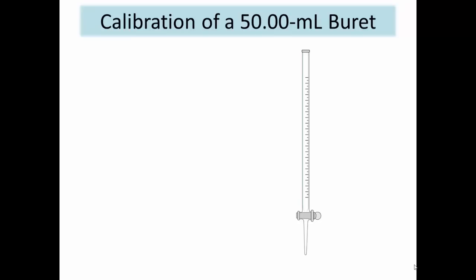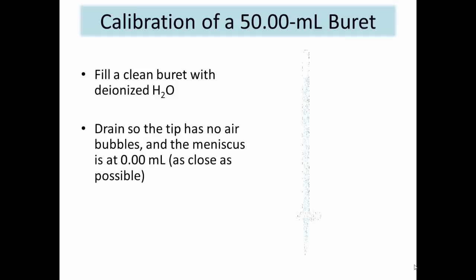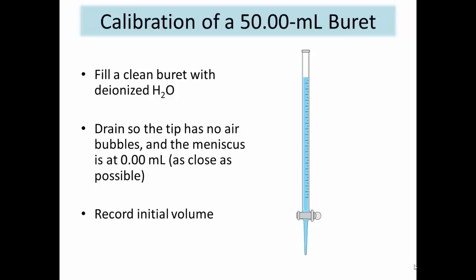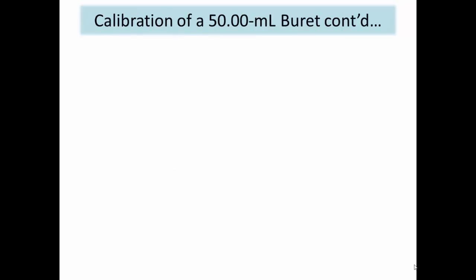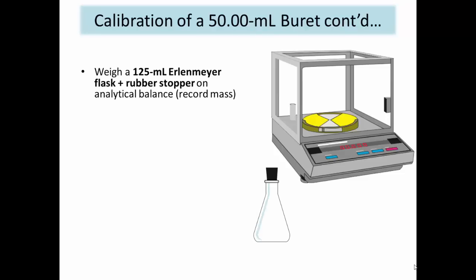Calibration of volumetric glassware, such as a pipette, is important because it gives an analyst an idea of how close the actual volume of solution it contains is to the volume indicated. For example, how close is the volume of a 25 ml pipette to exactly 25.00 ml? This depends on the temperature of your solution and the buoyancy force caused by the displacement of air by the water. To begin, fill a clean burette with water and make sure there are no air bubbles in the tip. Drain the burette until the meniscus is close to 0.00 ml and record the exact initial volume to two decimal places. On an analytical balance, weigh a 125 ml Erlenmeyer flask and rubber stopper, recording the mass to four decimal places. Handle the flask with a kimwipe instead of your hands to avoid contamination.